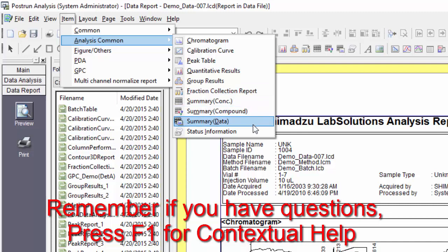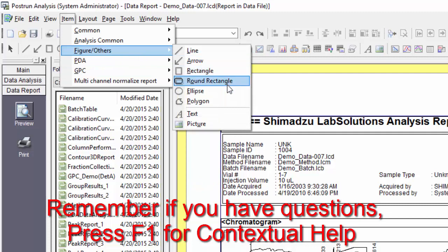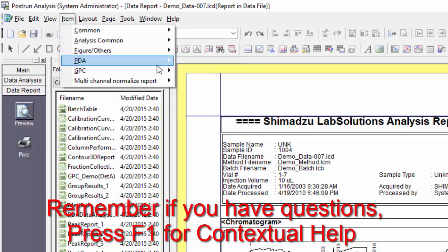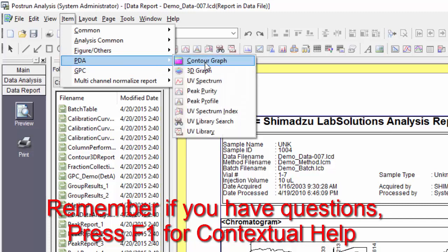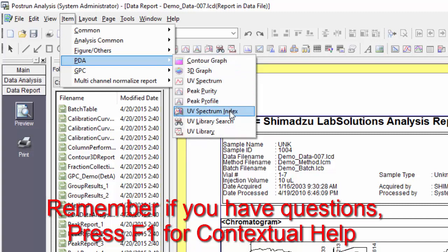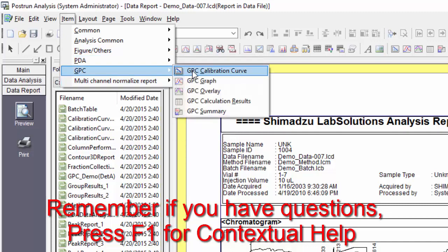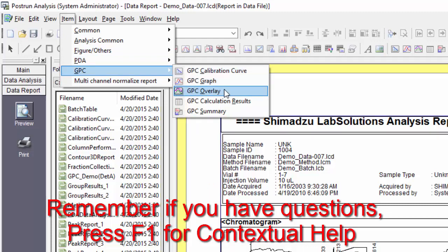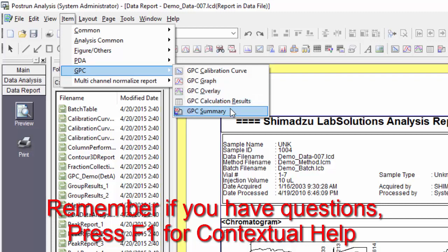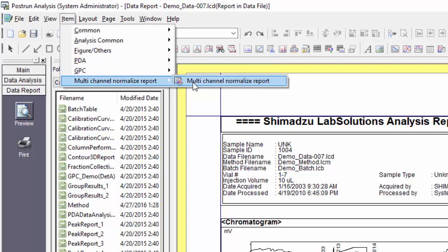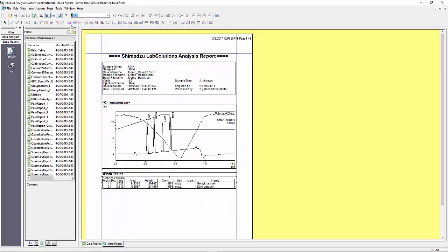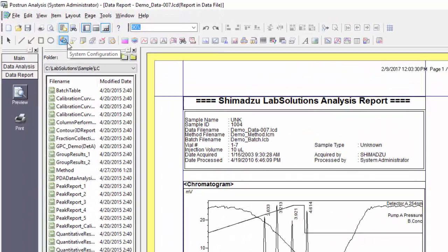Under figures you have options for adding in geometric shapes as well as text overlays and pictures. If you are reporting on PDA data you will have item options for contour graph, 3D graph, UV spectrum, peak purity, peak profile, UV spectrum index, UV library search, and UV library. If you are reporting on GPC or SEC samples you will have options for GPC calibration curve, GPC graph, GPC overlay, GPC calculation results, and GPC summary.